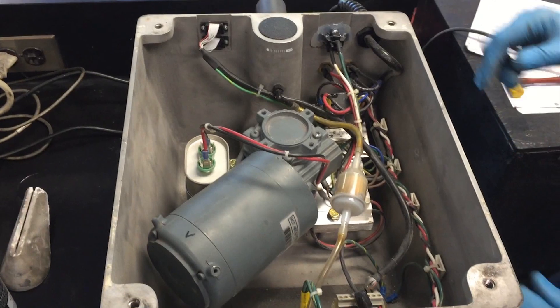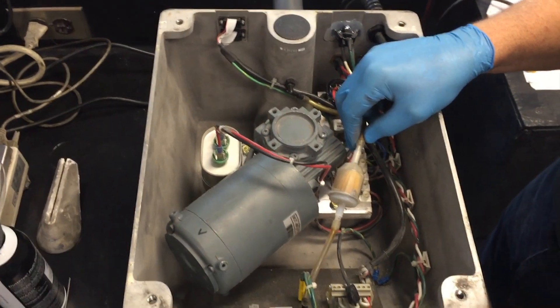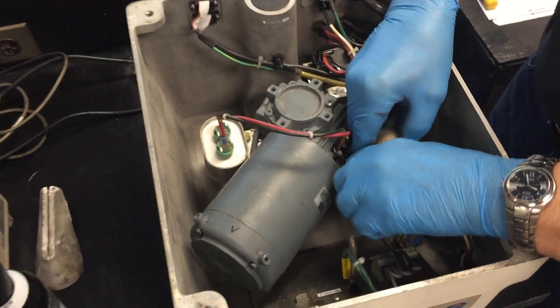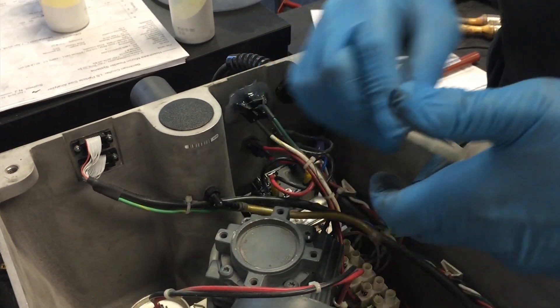The primary reason for this is to confirm that the filter here, which protects the vacuum pressure gauge, is clean. We're going to remove the filter by simply pressing against the hose and taking the hose off.